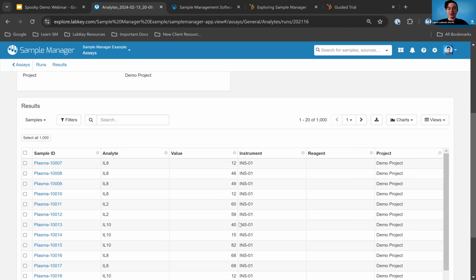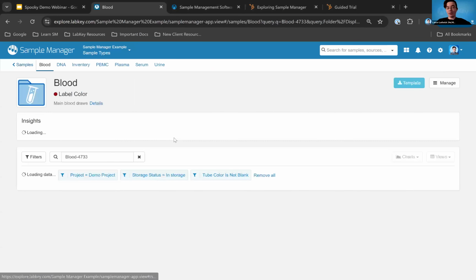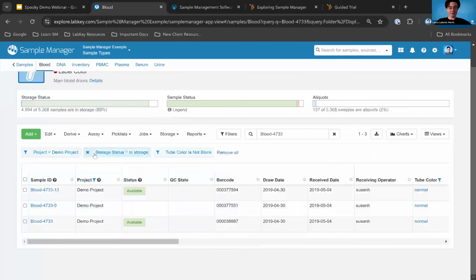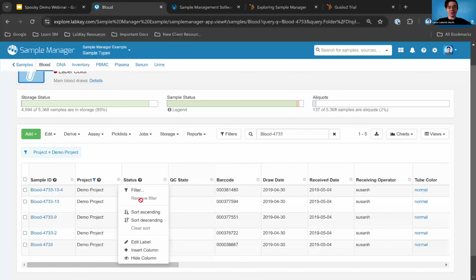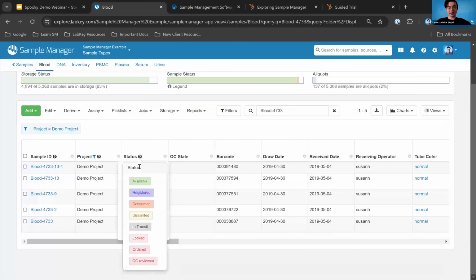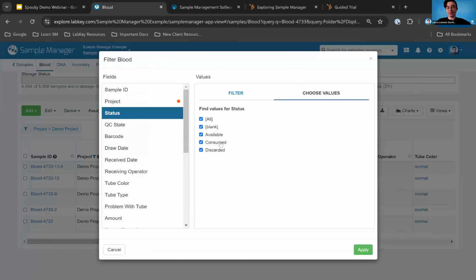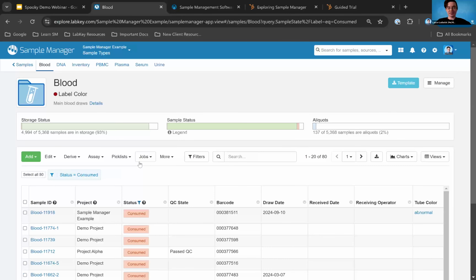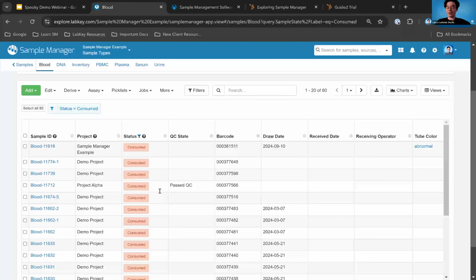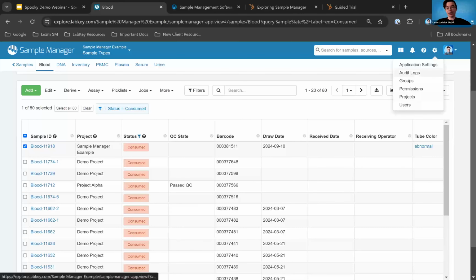Once a sample is discarded, how long does its record stay in LabKey? That's a great question. So I can pull up all my samples that have been discarded. So these are samples that haven't really been deleted. This is what we recommend if you are getting rid of different samples: you can mark them as consumed. And as long as I have all my search filters set correctly, you'd be able to pull these up. We don't delete this information. Now, if you do truly delete a sample, you'll still be able to view its records in our system-wide audit log and get more information there.